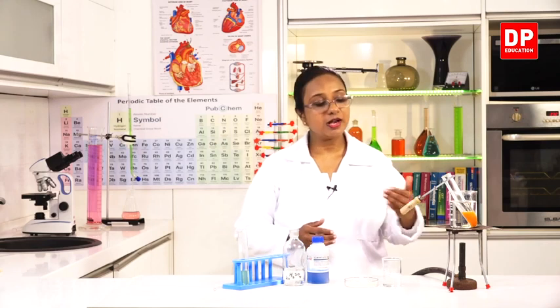So from this, students, you can understand what has happened to the sucrose in the sugar. With the addition of sulfuric acid, sucrose has been hydrolyzed to glucose and fructose, and the glucose gave the color change with Benedict solution. So you have seen the observation clearly and you have understood why we did this activity in two parts. First there was no color change, then we saw the color change very clearly.